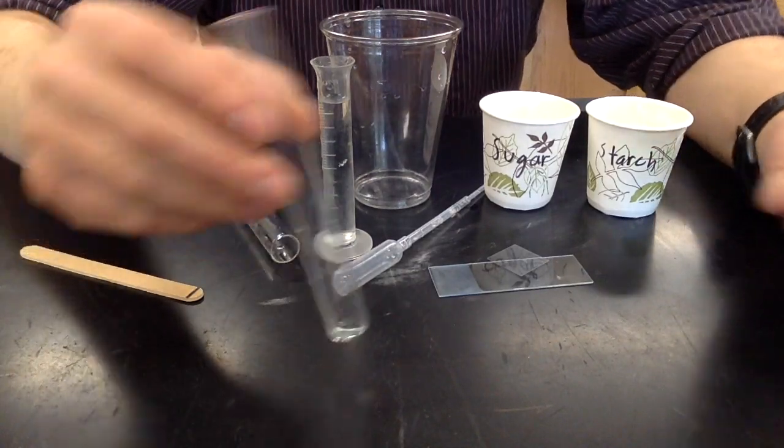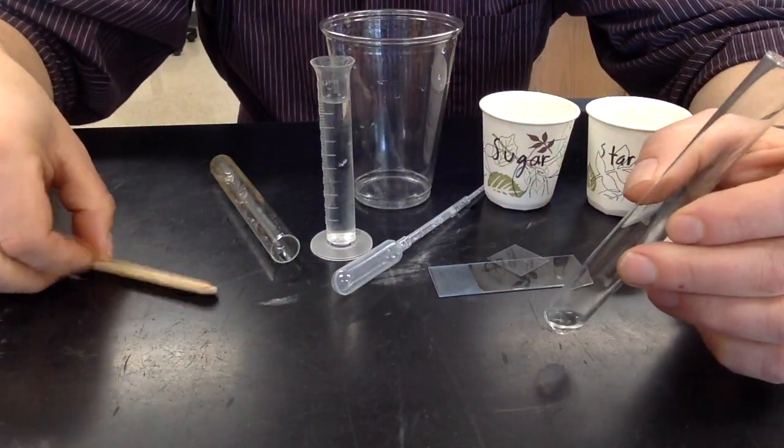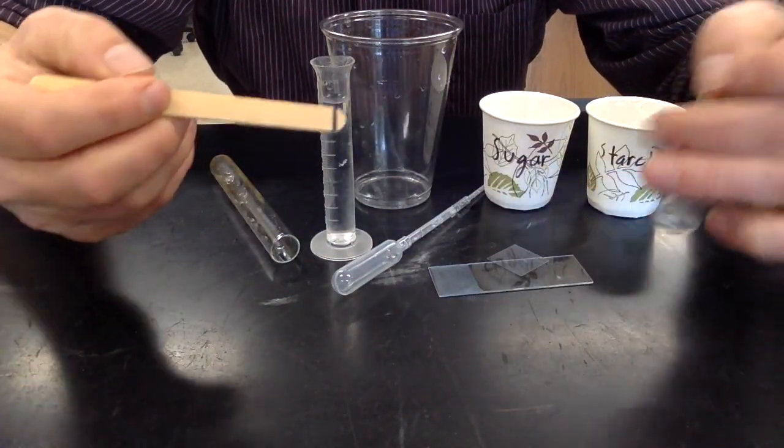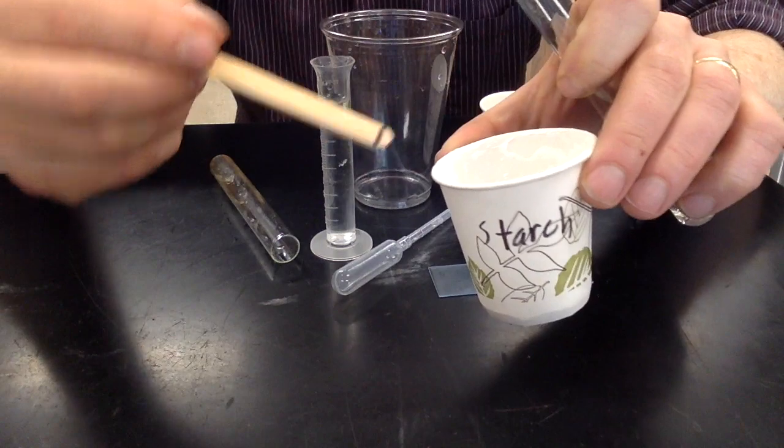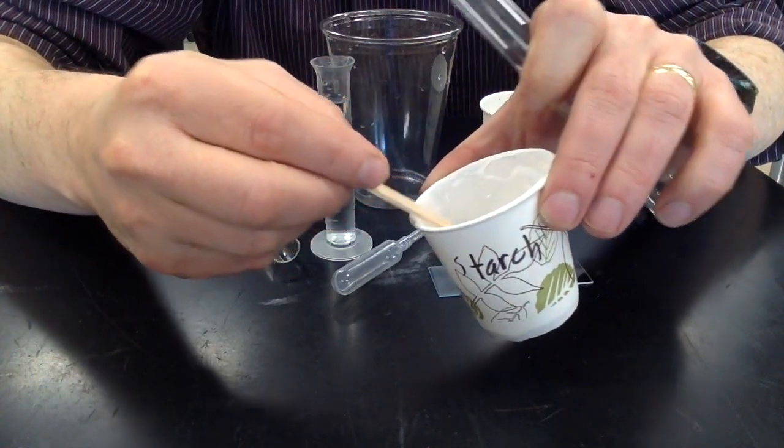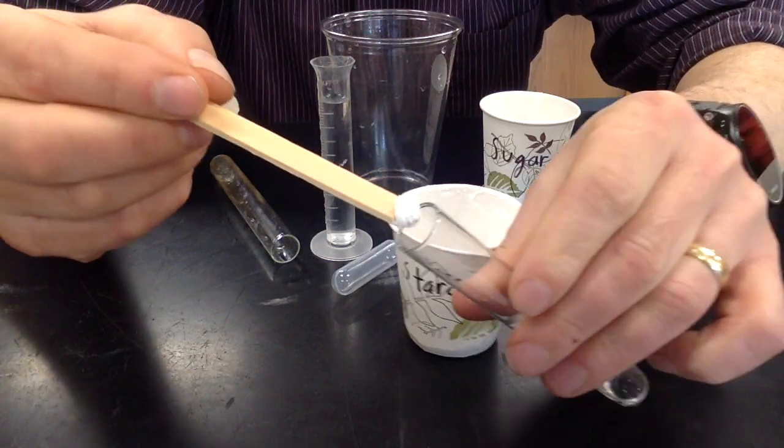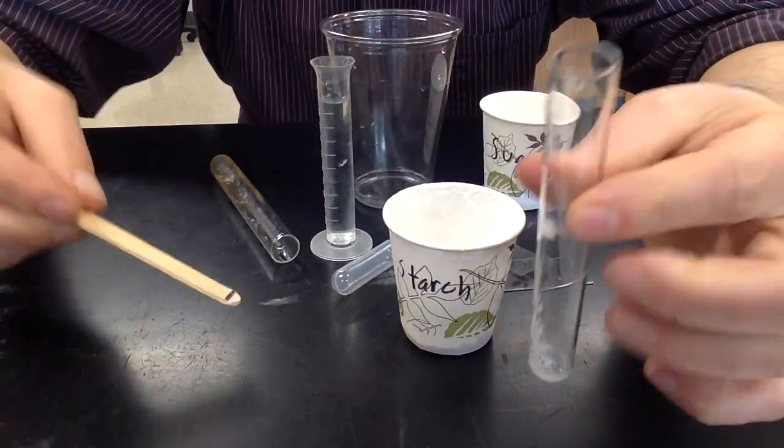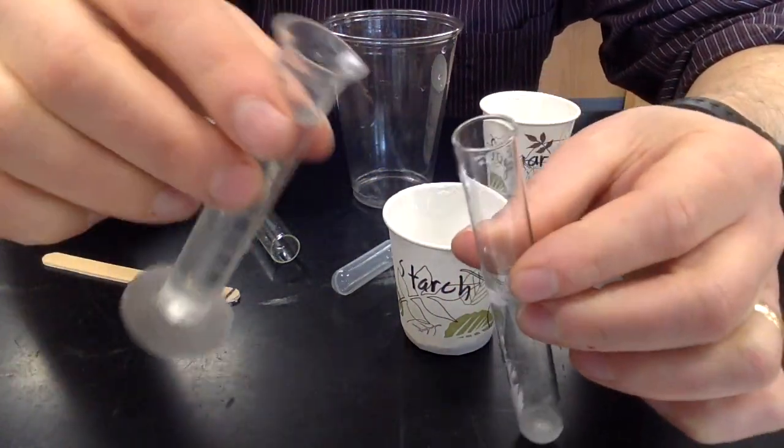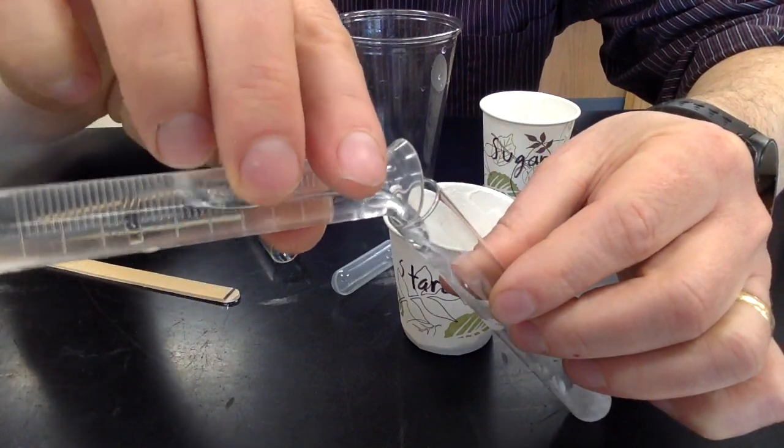You will conduct the solubility test for starch and sugar the same way we have done in the past. The popsicle stick is marked with a black line that should show you the amount, the size of a grain of rice. You select a small amount of the starch and the sugar, one at a time, and you add 10 milliliters of water to them.